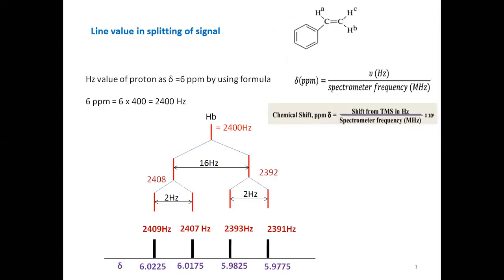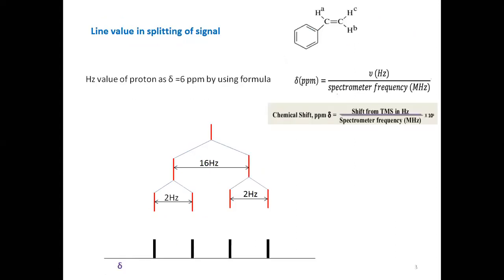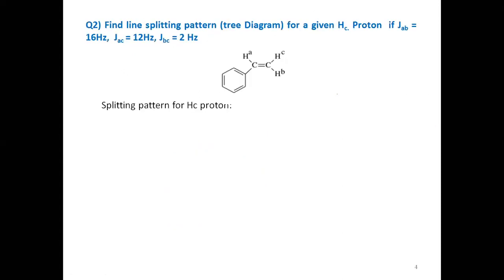Sir, 12 hertz and 2 hertz. Okay, for HC, it is giving a doublet of doublet with 12 hertz and 2 hertz. Yes. So it is not 16, it is 12 and 2 hertz here.